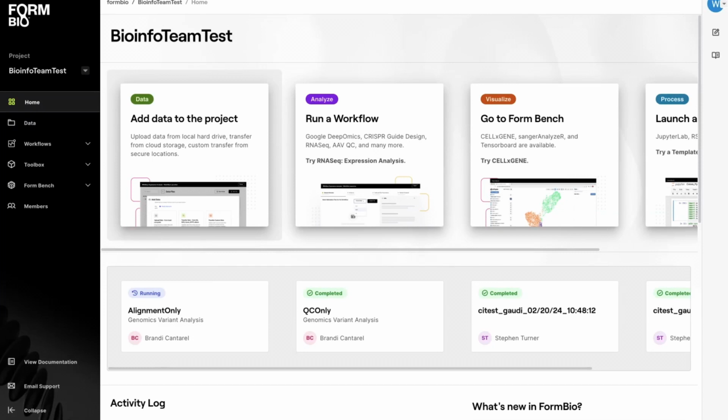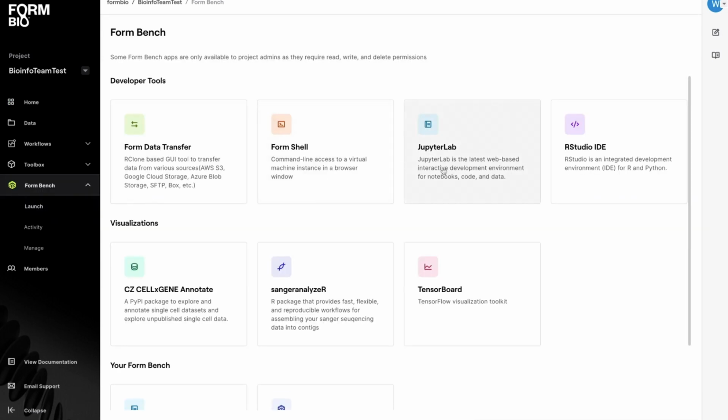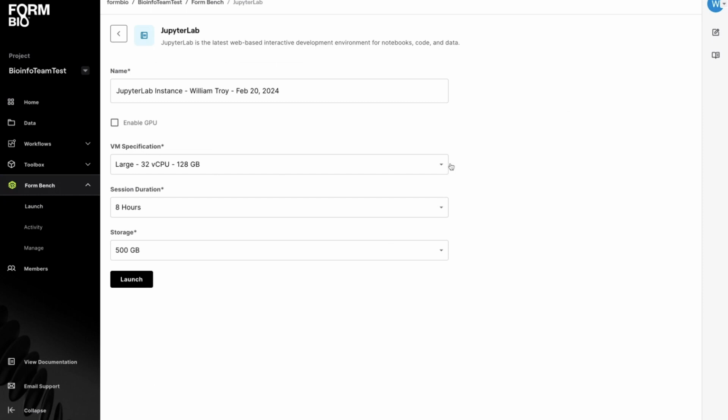This is an intro video on how to use the Jupyter Notebooks on the FormBio platform. You start off in your project home, go down to Form Bench on the sidebar, click Launch, and then from here you can scroll over and go to Jupyter Lab.